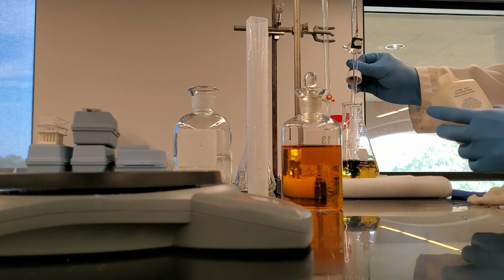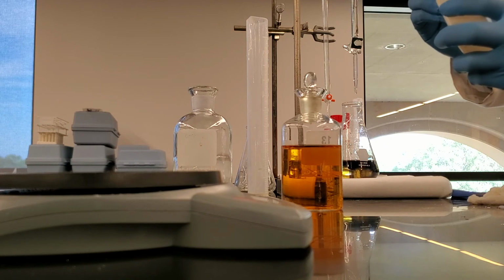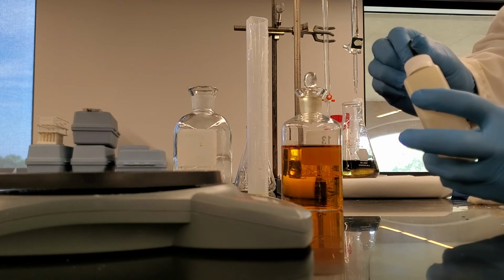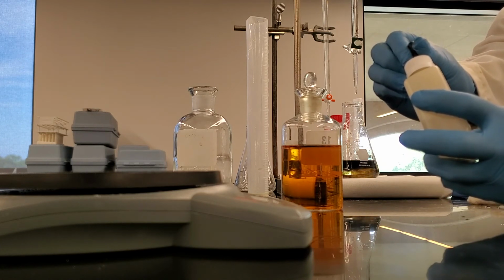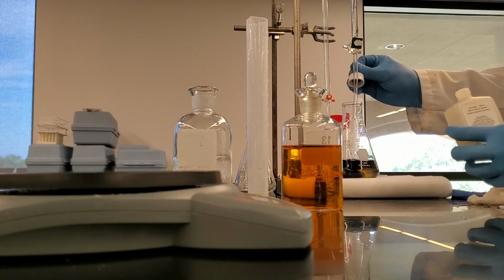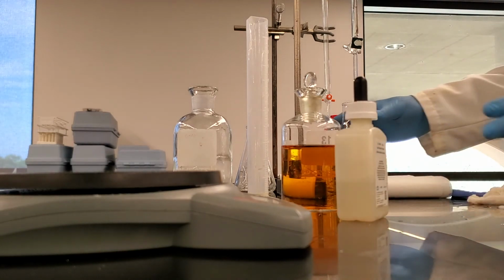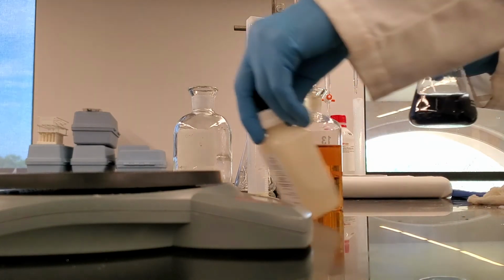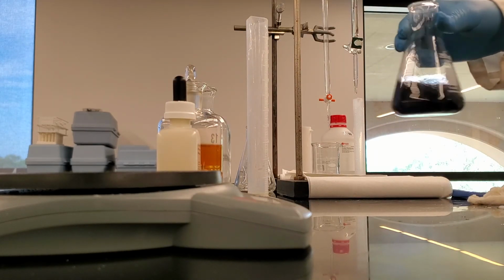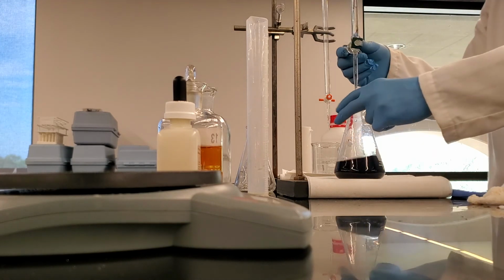I'm going to add this one. And then I'm going to take one more 1 milliliters. Remember, I'm squeezing the top, and once it's inside the starch liquid, I'm gently releasing it. Again, I have 1 ml. All right, so added 2 1 ml drops. I'm going to gently mix it. So I'm going to continue the titration to a colorless endpoint.